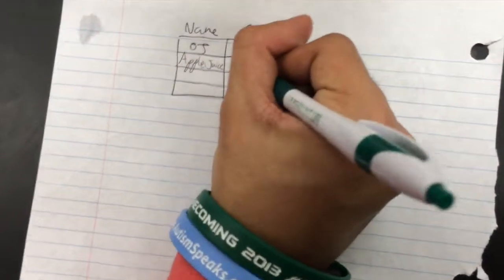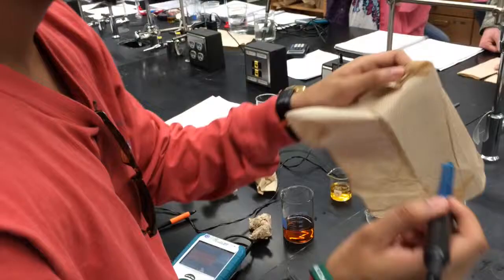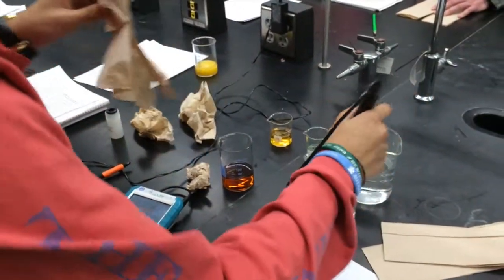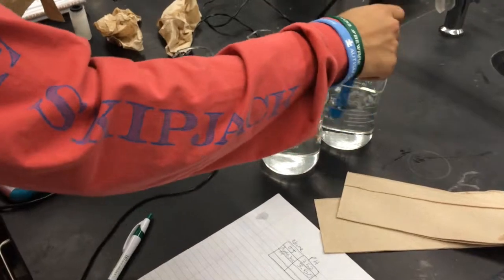Rashik is now testing the solution, apple juice, for its pH. The pH of apple juice comes out to 3.50. Now that Rashik is done, he cleans the probe of the pH meter and prepares it for storage.